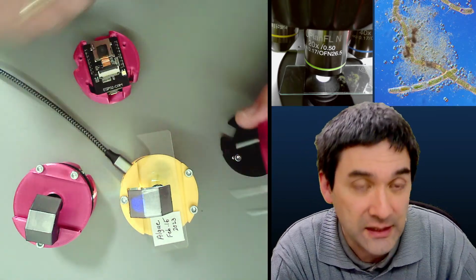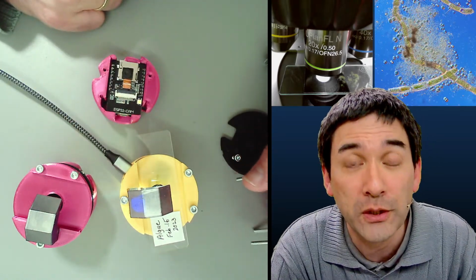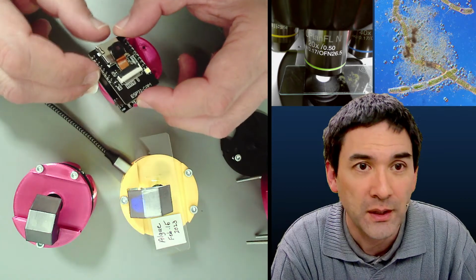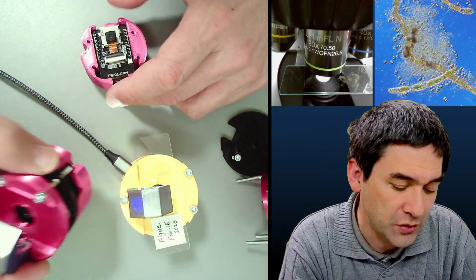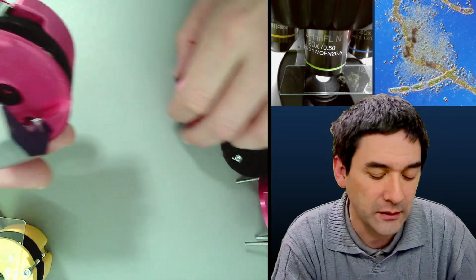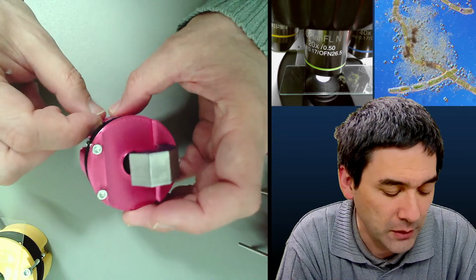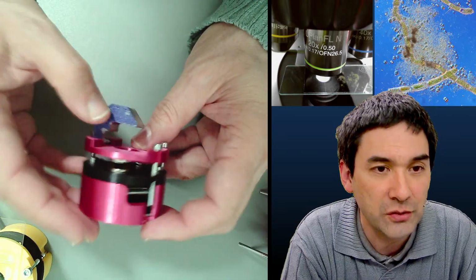And the good thing is this camera can be programmed as well. However, it works pretty much out of the box, so there is no programming necessary, but you can program it if you want to. What I'm going to do is show you how this microscope is designed. Let me push this to the side a little bit, because the focusing mechanism is quite fun as well. What you have in here is the camera module, and the stage, the top part here.